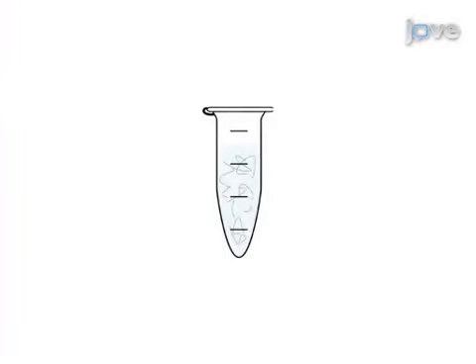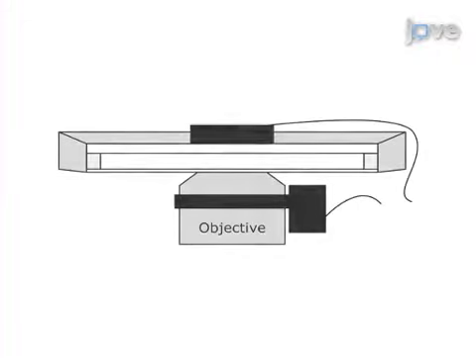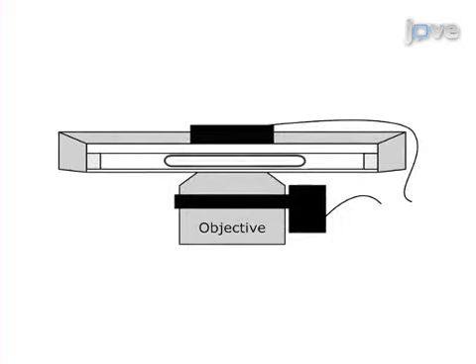The second step is to prepare a gel of low melting temperature agarose made with M9 minimal media. Next, an agarose gel pad is prepared for use with a temperature-controlled sample chamber. The E. coli cells are placed on the gel and the chamber is assembled.